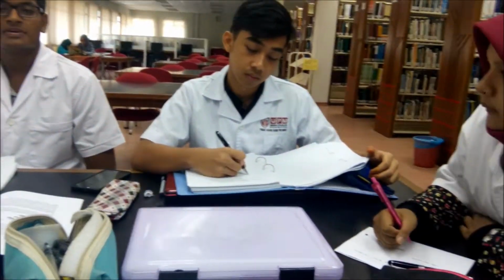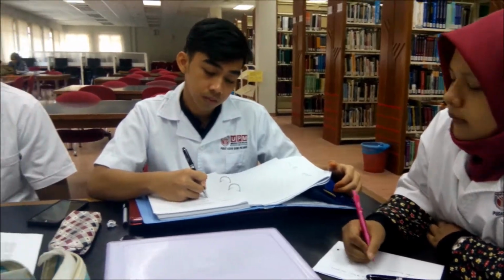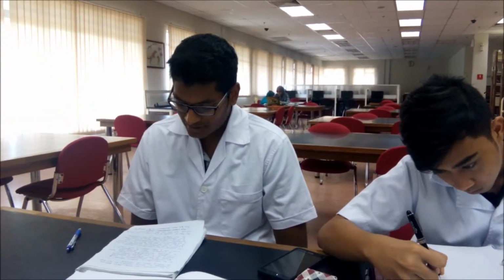P-nitrophenol, when mixed with basic solution, appears yellow. The intensity of the yellow color is directly proportional to the amount of p-nitrophenol present. Therefore, it can be used to estimate the amount of product formed in each set of the experiment.